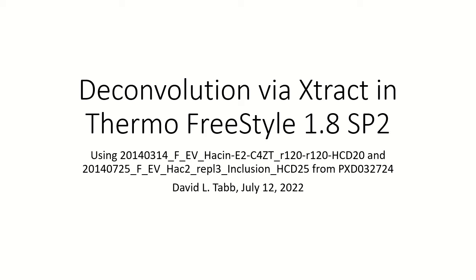Now I'm going to be using a pair of raw files. You can see that their names are pretty long and ungainly, but they appear on this slide. These are both drawn from PXD032724. This is a set we've recently published with Hilde de Roos's team here at Institut Pasteur. The data were collected, as you can see, back in 2014, so they're relatively compact and easy to process, and I think that they'll be good examples for us to walk through.